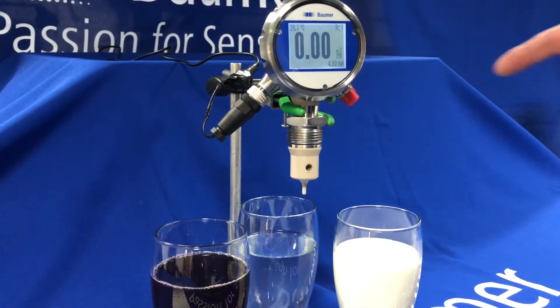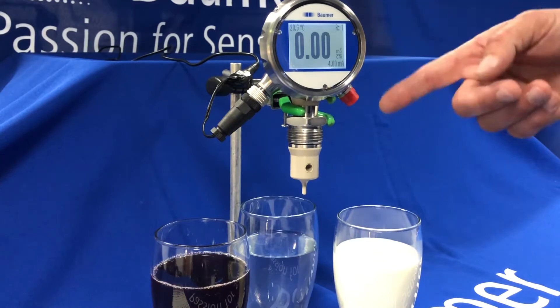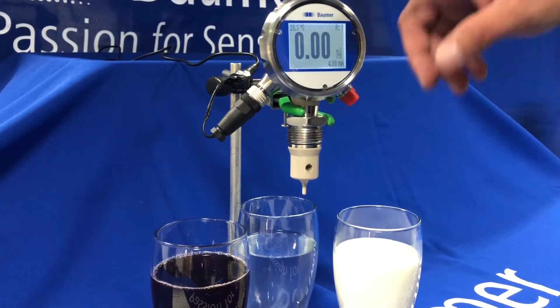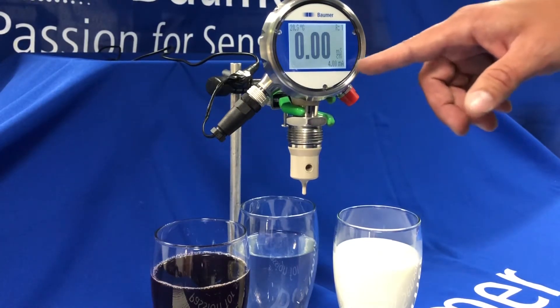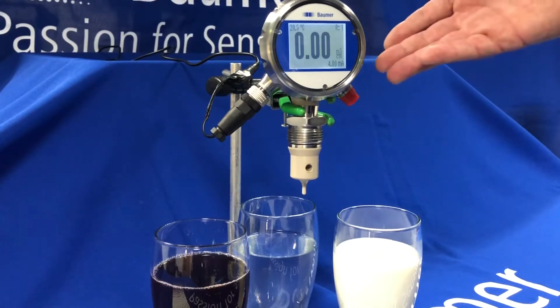I just wanted to do a quick video to show you our AFI conductivity transmitter with DFON digital display — a touchscreen programmable display with lots of features. I also wanted to show a cool feature of how we determine phase separation within a CIP system using this sensor.